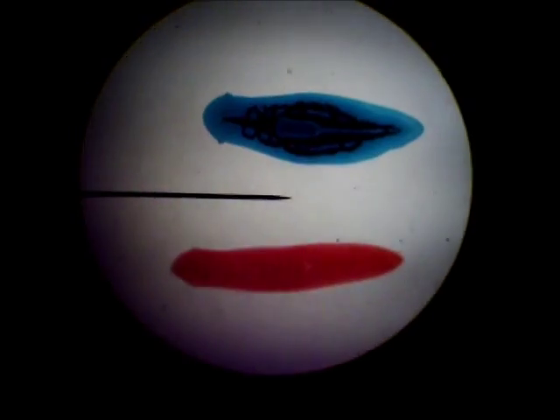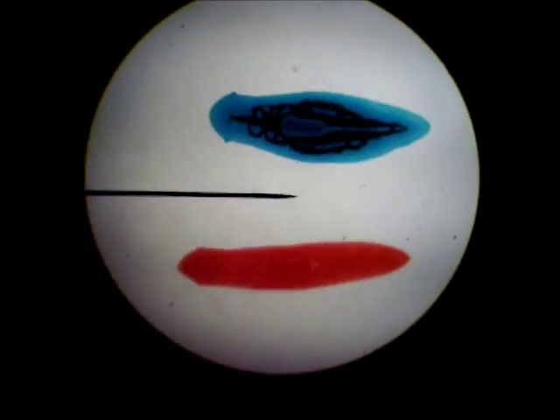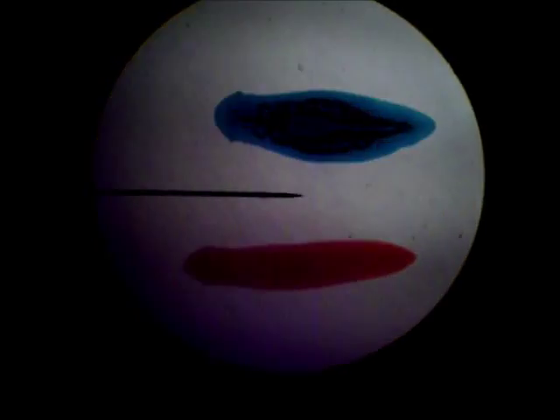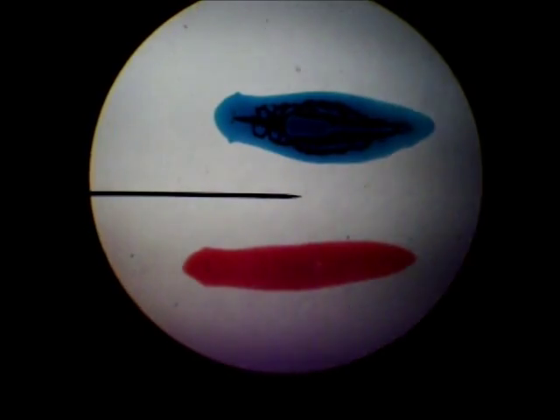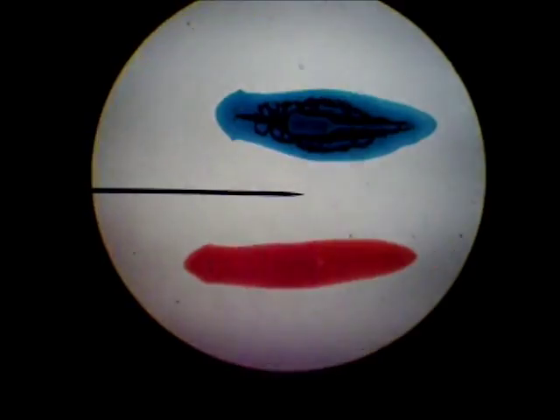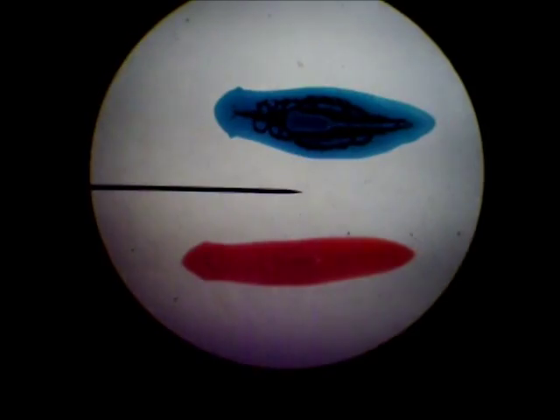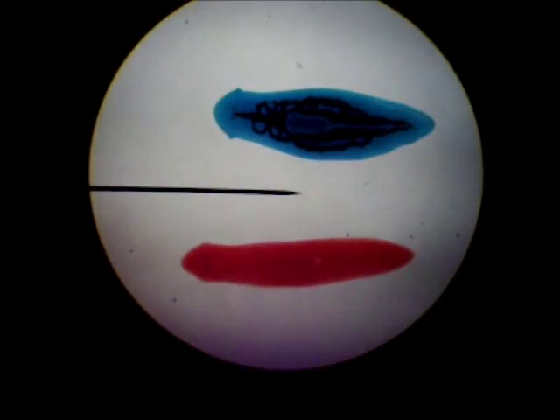This is a planaria, it's a flatworm, and it's in Phylum Platyhelminthes — spelled P-L-A-T-Y-H-E-L-M-I-N-T-H-E-S. This is a planaria with the digestive system dyed, Phylum Platyhelminthes.